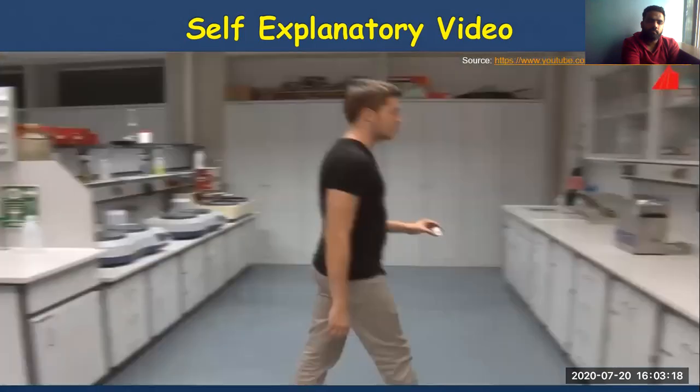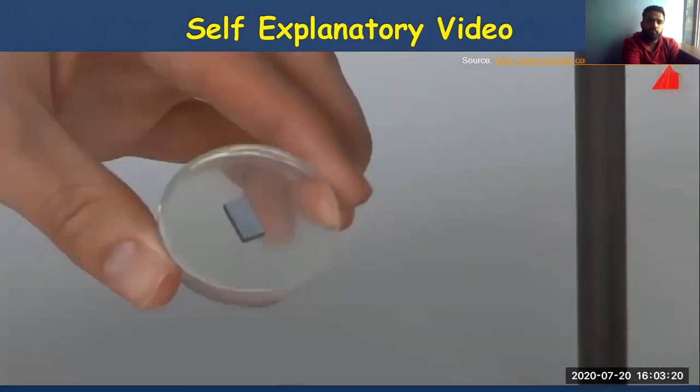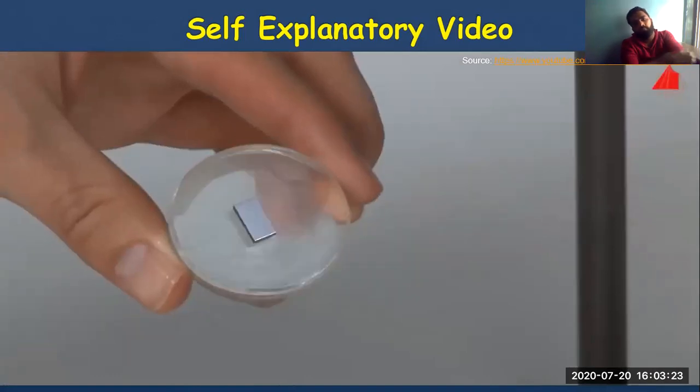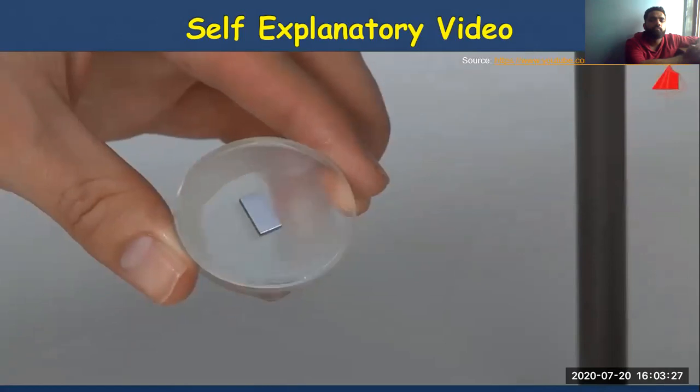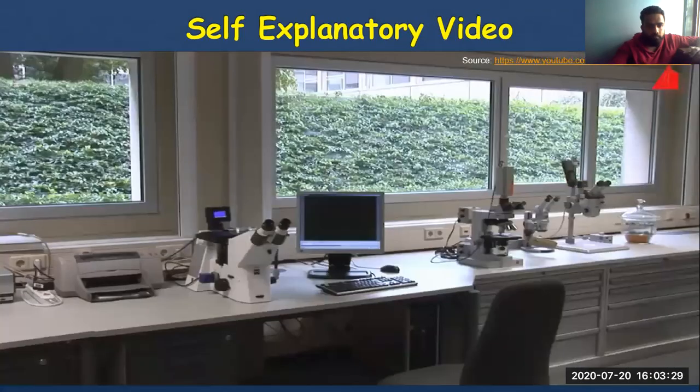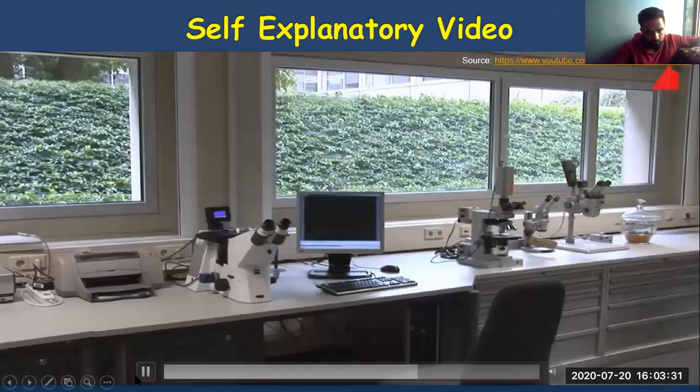From now on, the sample is called a metallographic specimen or microsection. Judged with the naked eye, our metallographic specimen seems to be well prepared. It is now allowed to go under the microscope for the first time. You can see they have not yet used the etchant.